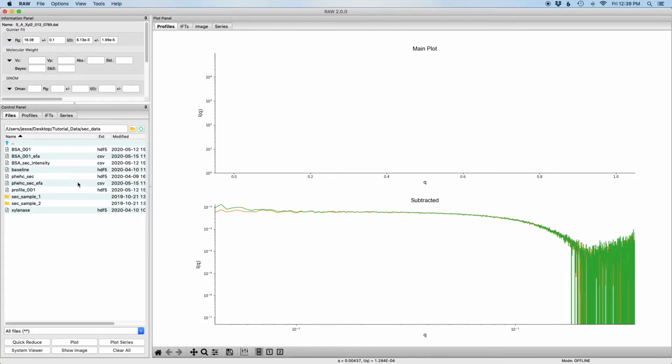So next we're going to learn how to do an integral baseline correction. These are usually best for when you have some kind of, say, capillary fouling that's causing a constant change while the sample's eluting, but no change otherwise.